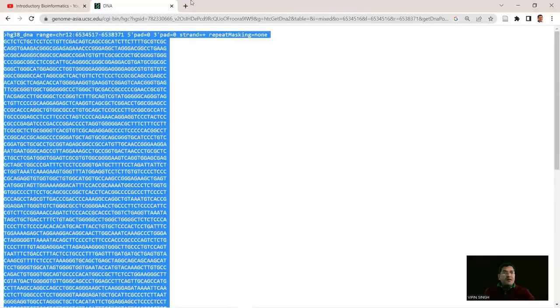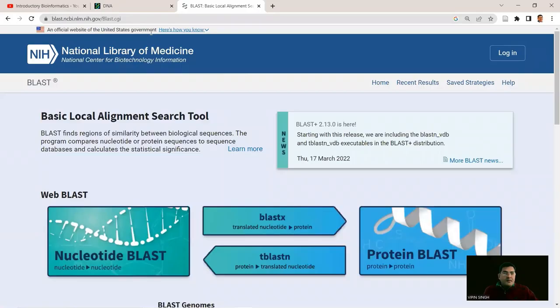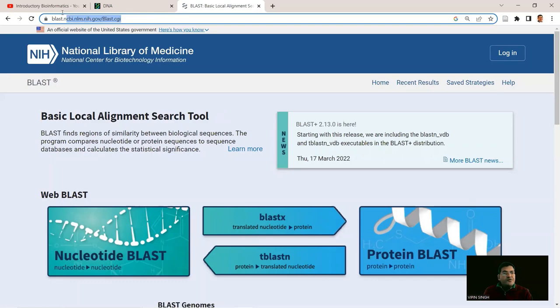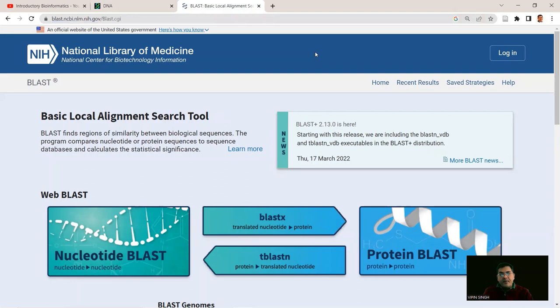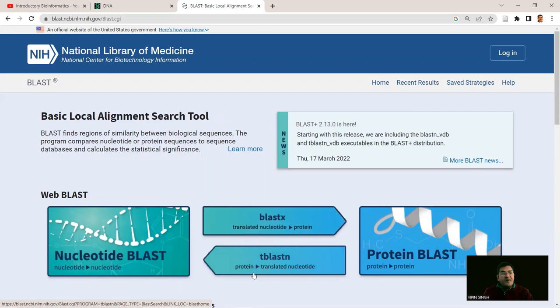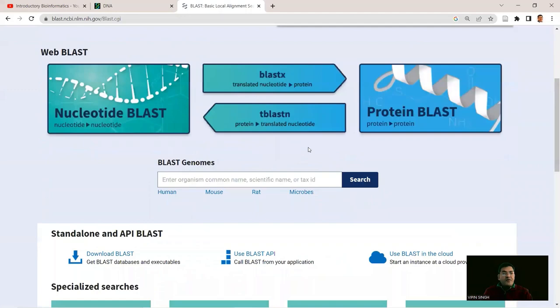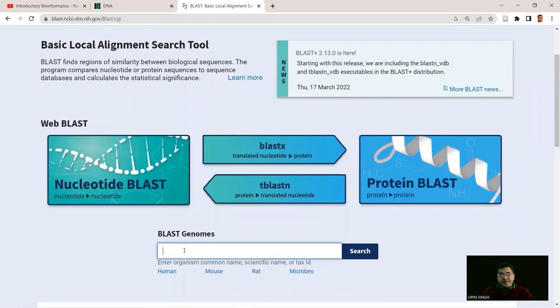We select all and copy the sequence, then go to the BLAST home page at blast.ncbi.nlm.nih.gov/blast.cgi. BLAST comes in several flavors: BLASTN (nucleotide to nucleotide), BLASTX (translated nucleotide query against protein database), TBLASTN (protein query against translated nucleotide database), and protein-to-protein BLAST. Since we're interested only in chimpanzee, we can do a direct BLAST to genomes — searching our query sequence in the chimpanzee genome.